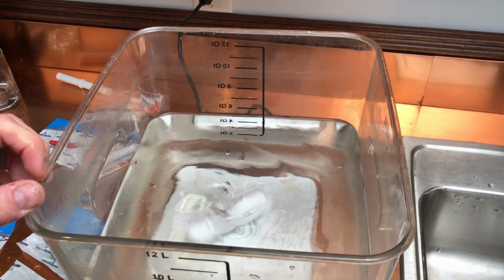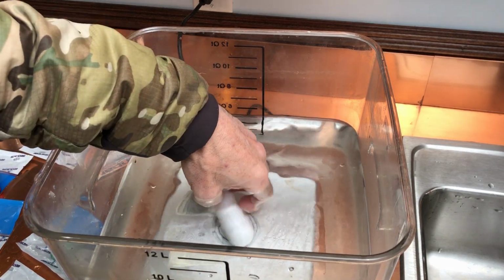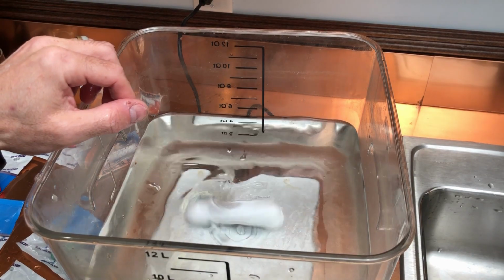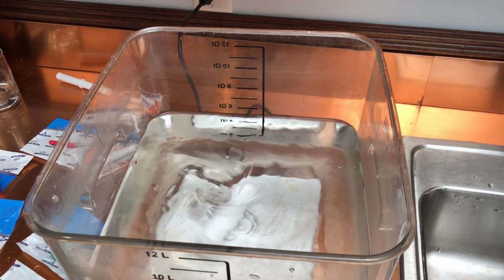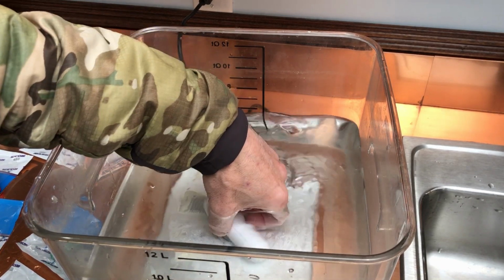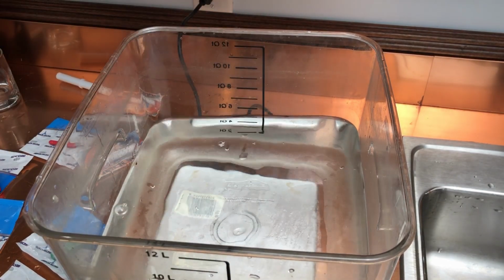Moving quite a bit of water. I'll try to increase the speed. Oh. Yeah, I think it's still too long. Too long for this plate. Now I could leave it like that and it would be fine. But I'm only using about 15% of this plate's rotational capability. So I wouldn't necessarily buy this one for my brand of plate.